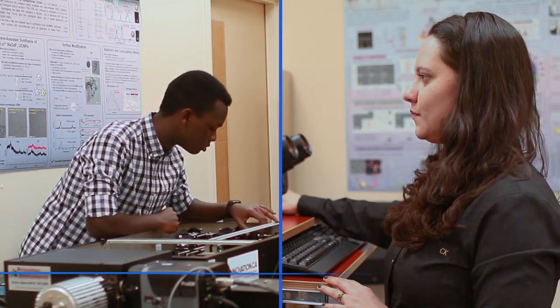Demonstrating the procedure with Nelson Rutajoga will be Emily Rodriguez, post-doctoral fellow at my laboratory.